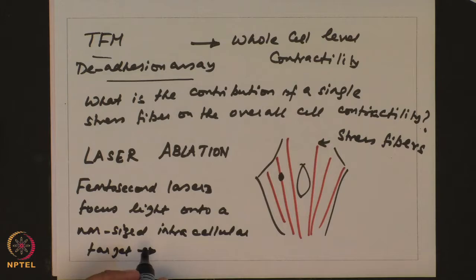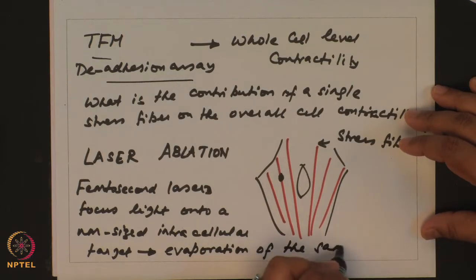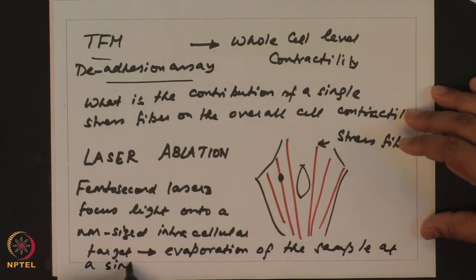This light is so focused that it will lead to evaporation of the sample at a single point, at the point where you have focused.